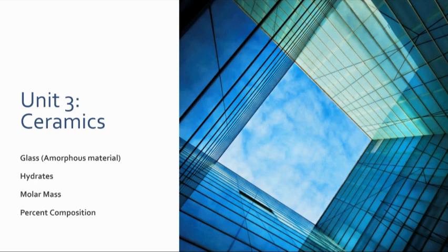Today's Playposit is going to look at glass, an amorphous material. And as we review the glass bead on a wire lab, we're going to look at what a hydrate is, how we calculate the molar mass, and how we find the percent composition of a hydrate.